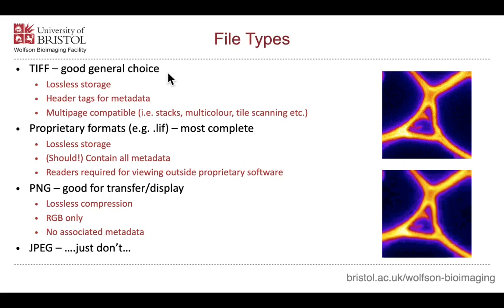So metadata is all of the information that comes from the microscope and is saved with your image. So even though you don't see it, all of the images will have a whole load of metadata saved with them. So which objective you used, which laser power you used, what detection bands you set, a whole load of useful things that enable you to repeat your image if you need to, or remind yourself of how you actually set up your experiment.